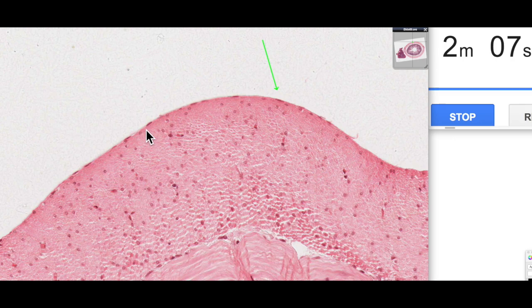So here, it's not about diffusion. It's actually about providing a smooth frictionless surface. If it was about diffusion, then we'd expect to see lots of blood vessels beneath. So it's not so much about diffusion here. Again, just making a nice frictionless surface.